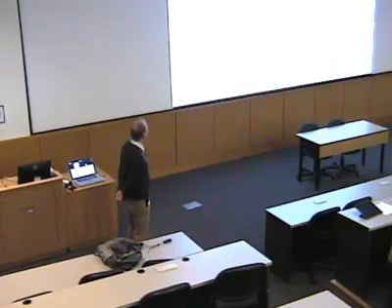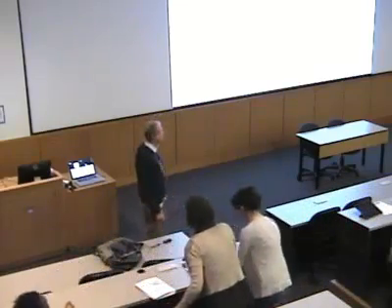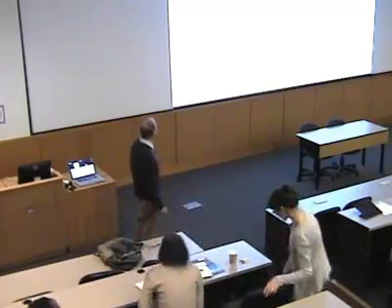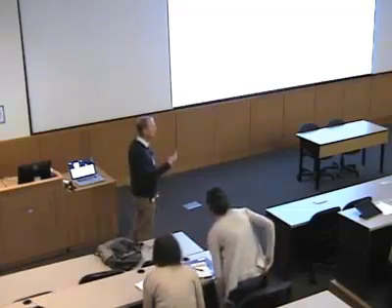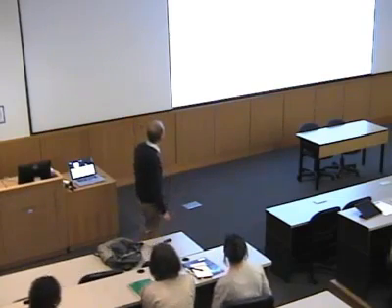The main difference is that we use continuous microwave radiation. So in all of what I'm talking about, there will be no pulses involved, and we'll be using a single microwave frequency. Stefan Stoll, who will be giving the next talk, will then take you on to the more modern methods where we use microwave pulses and multiple frequencies. He'll talk about ENDOR and things like that.